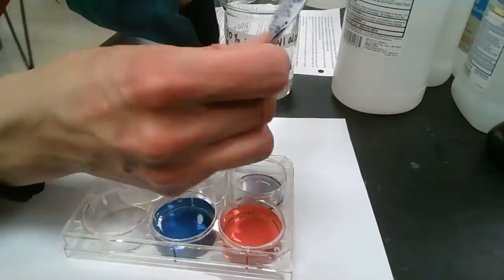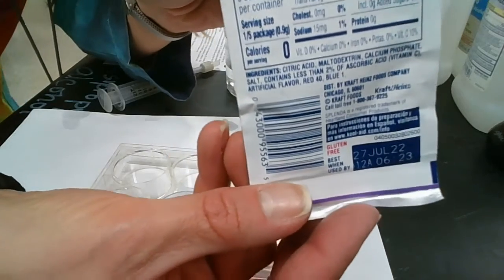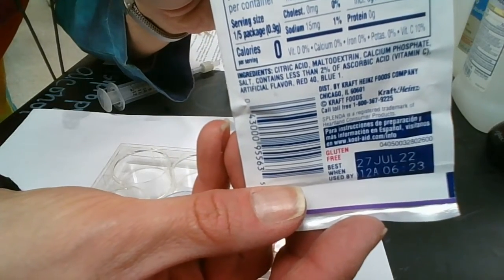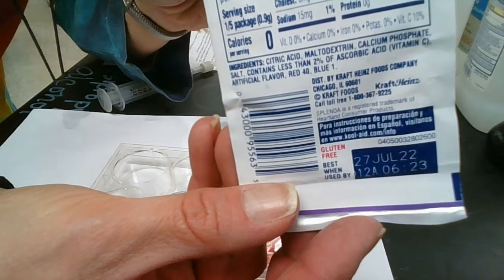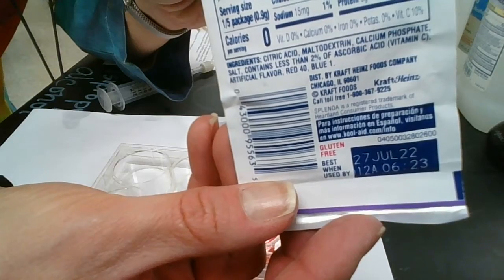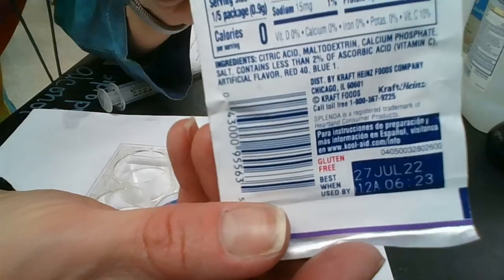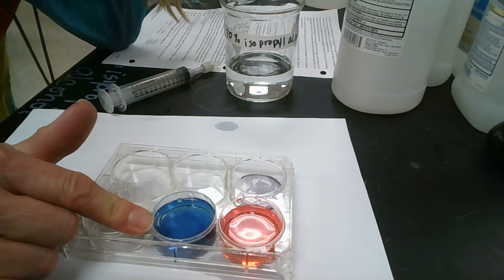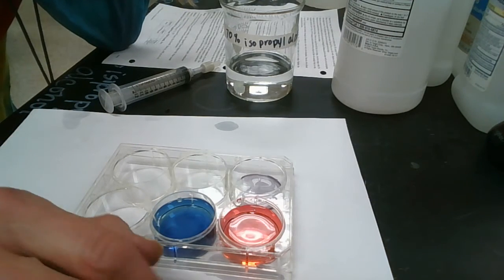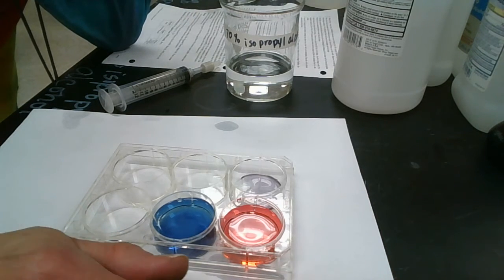Now, if I check out my grape Kool-Aid package and read the back of the package: citric acid, maltodextrin, calcium phosphate salt, contains less than 2% of ascorbic acid (vitamin C), artificial flavor, and look at those last two ingredients, Red 40 and Blue No. 1. Sure enough, I've separated Red 40 from Blue No. 1. So that's our column chromatography of the dyes in Kool-Aid.